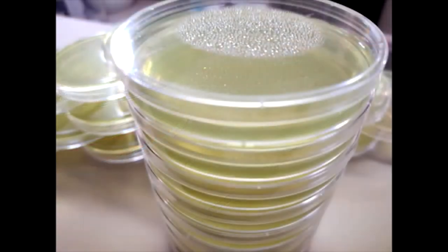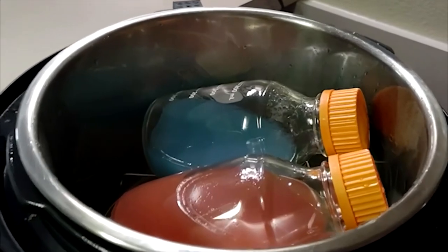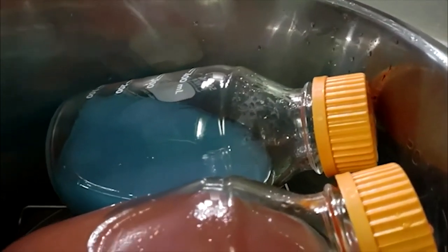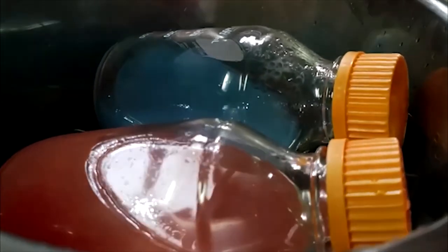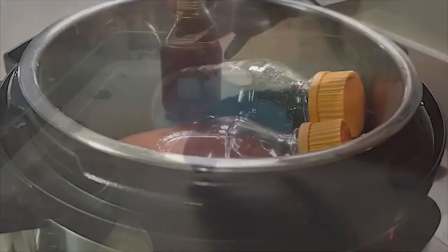Again, as a reminder, if you have any condensation, just flip your Petri dishes or your jars upside down. We recently had a comment asking about the temperature of your agar before you actually pour it, and we have found in between 120 to 140 degrees is just the perfect cooling temperature to start pouring.